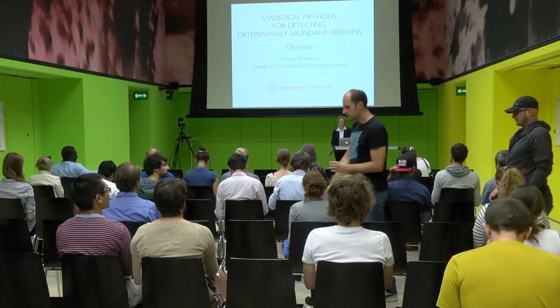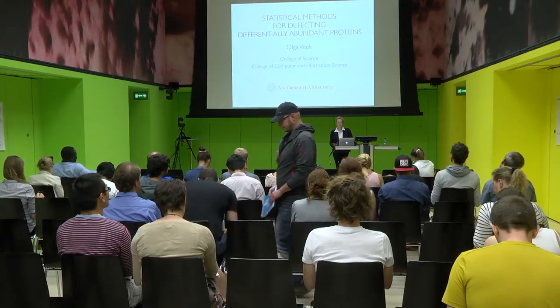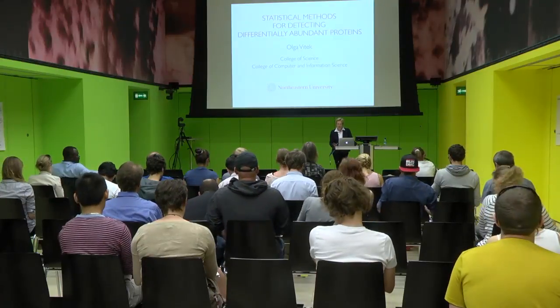Yesterday we concentrated mostly on defining the question that we may want to answer with quantitative targeted proteomics experiments. And we talked about the experimental design, and the three fundamental principles of experimental design: replication, randomization, and blocking. These need to be considered before we conduct the experiment, before we even plan out the entire study. The goals of replication, randomization, and blocking are to avoid bias, a situation where our conclusions from the data are systematically incorrect, and also to maximize the efficiency, or minimize the inefficiency, of the experiment, which is translated into the variance of the differences that we look into, right?